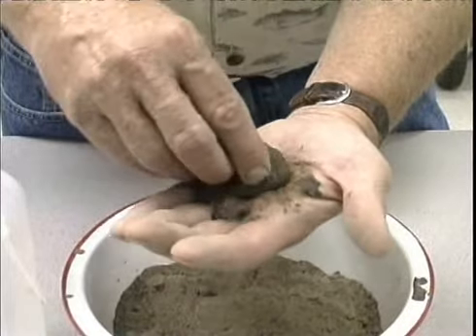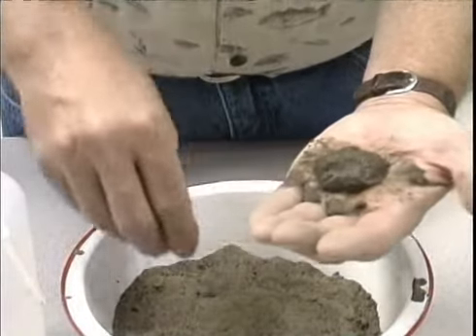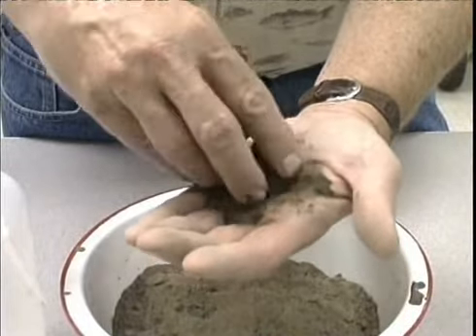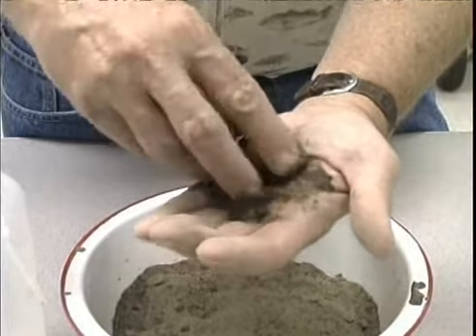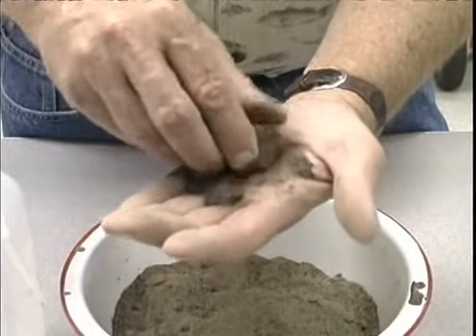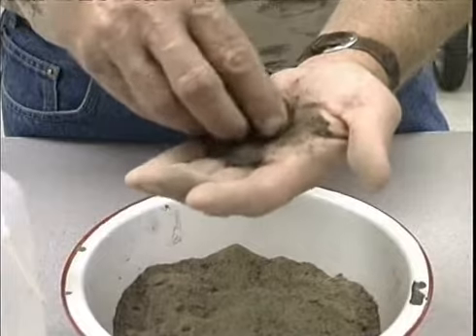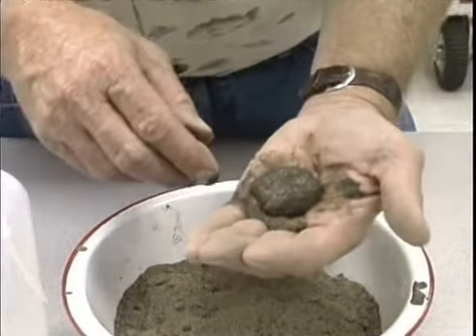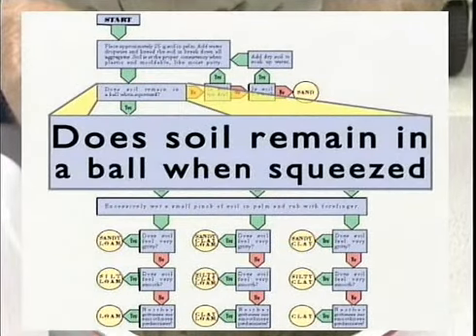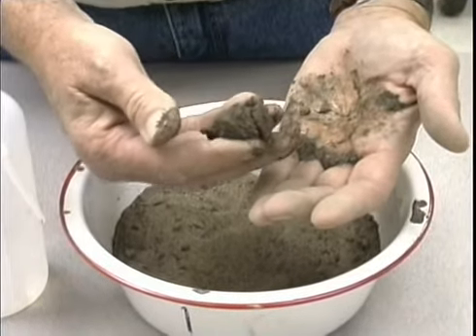Now I'm determining in this particular case that I've got just a little bit too much moisture in this one. You notice that there's free moisture still on the surface of my hand when the ball is lying there. So I need to add just a little bit more dry soil back to it to get this to the right moisture content. I don't want excessive moisture. That appears to be about the right consistency. So this soil, when wet, will form a ball that does have some ability to form this moldable ball.